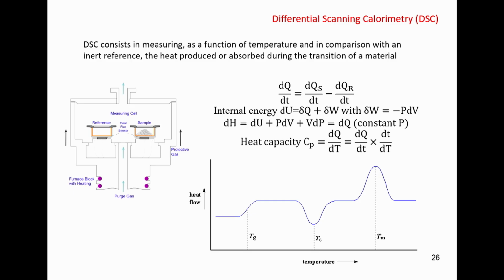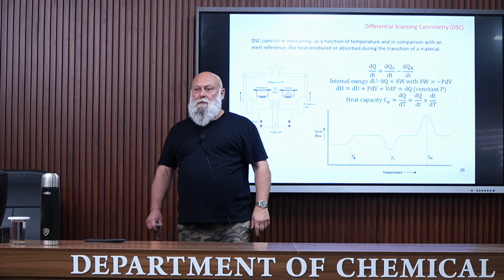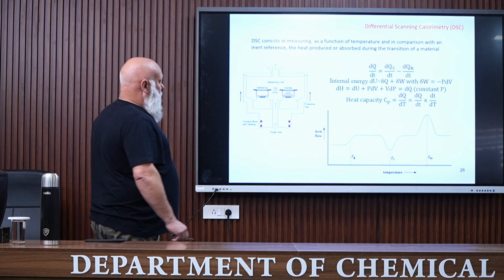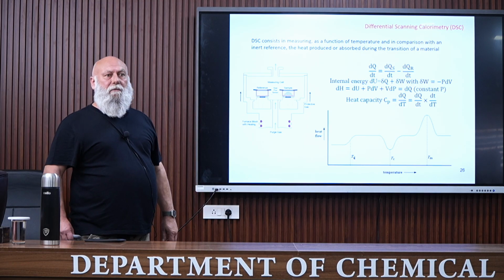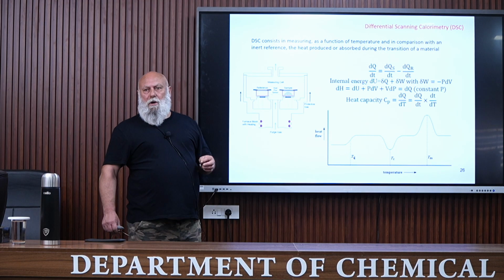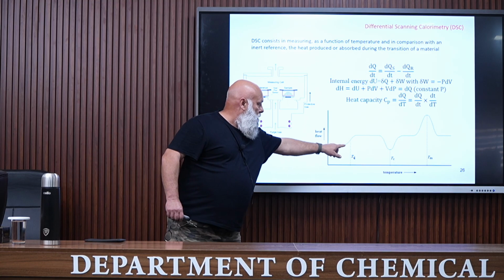We can observe two types of peak. Usually the endothermic and exothermic directions are indicated. Here, in this case, the endothermic direction is up, because we have a peak here which is in the exothermic direction. That refers to crystallization. And here, a peak in the endothermic direction refers to melting. Melting and crystallization are first-order transitions. Now, a second-order transition is characterized by a sharp change in the first derivative of enthalpy, which is the case here.